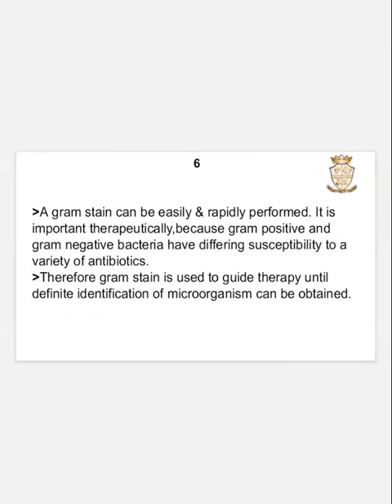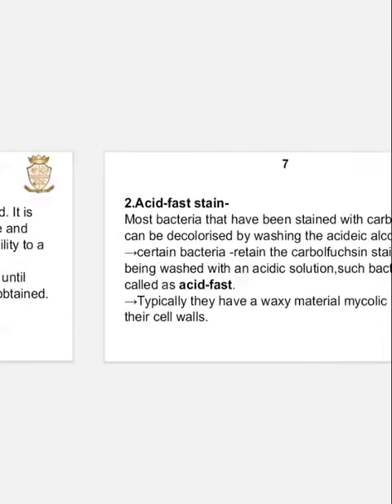A gram stain can be easily and rapidly performed. It is important therapeutically because gram-positive and gram-negative bacteria have differing susceptibility to a variety of antibiotics. Therefore, gram stain is used to guide therapy until definite identification of the microorganisms can be obtained.